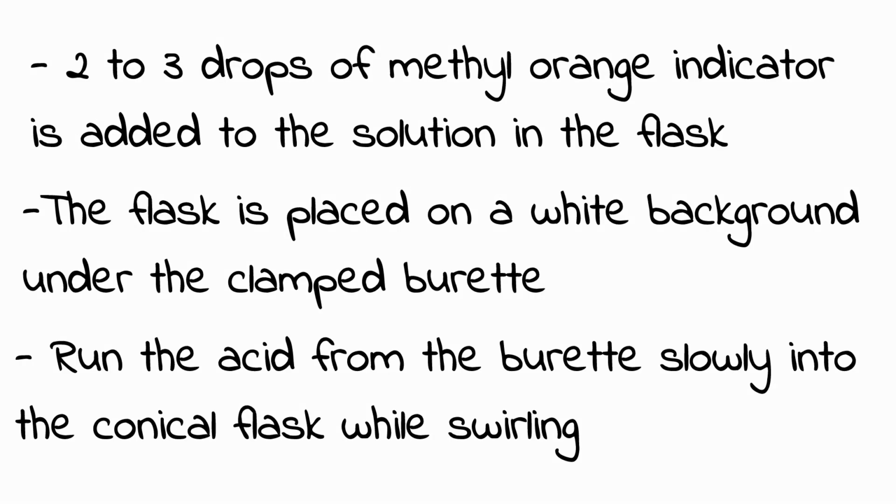Now your burette is clamped and filled to the 0.00 mark with hydrochloric acid. Your conical flask contains the pipetted 25 cm³ standard solution. The next thing you have to do is to add 2 to 3 drops of methyl orange indicator.